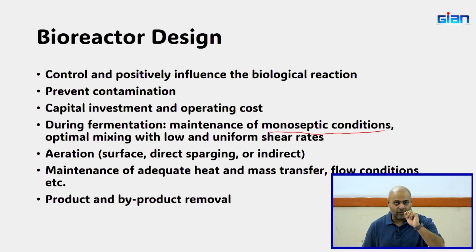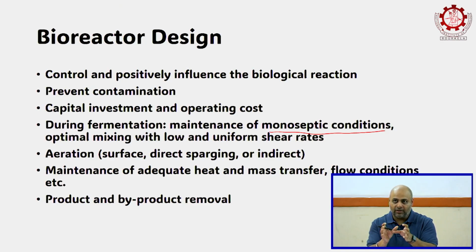So the nutrients that are going in are sterile. So you're only growing one microbe inside, the culture that you have put in is the only thing that is growing inside the reactor. You're not adding any contaminant to it. You're not adding any other microbial colonies or any other microbial population to it.